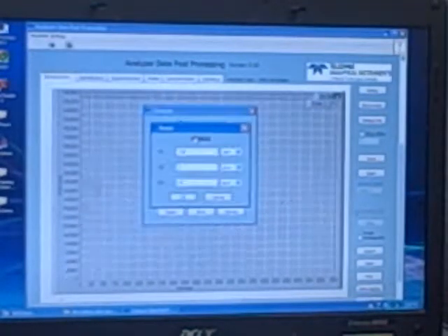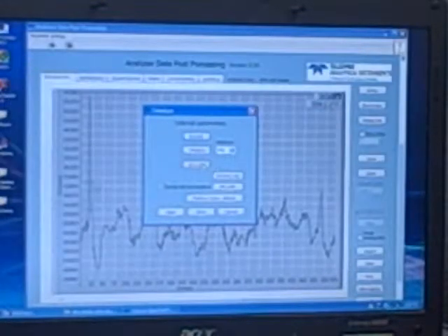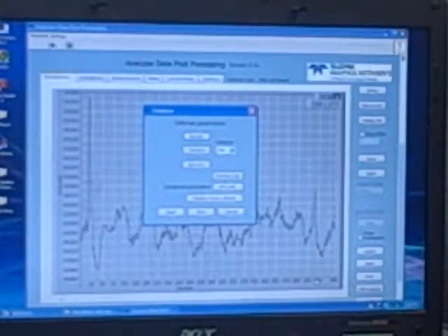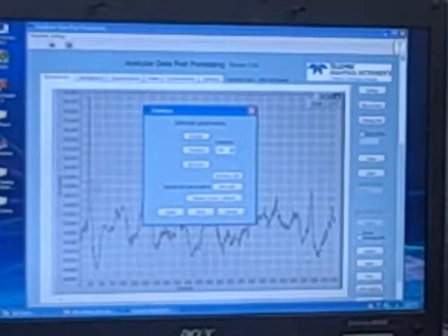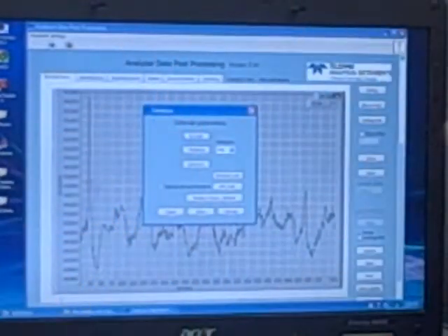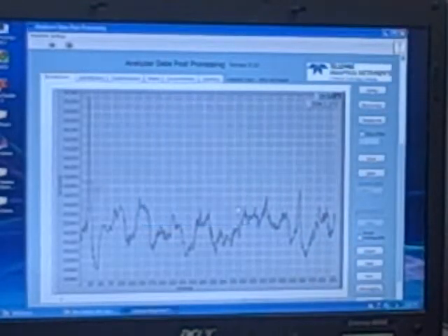When you already review through all this and click OK, and the timing, click OK, and the group, click OK, you are ready to make a measurement or download of the data file. So you have to remember, always click OK, OK. If you forget any of them, you get trouble later on. Very important for this new version. Now you can cancel it.